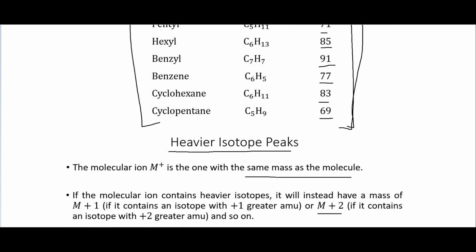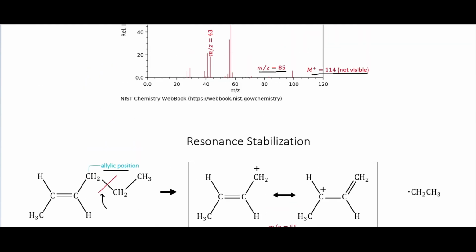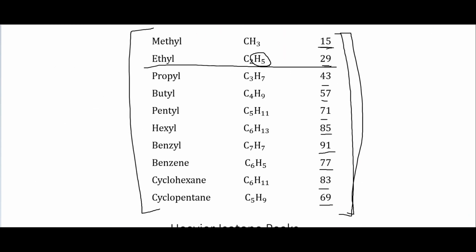But like I said, this can all start getting quite complex as you try to interpret it even more. But if you compare at least this basic level of being able to interpret these spectra with your IR and NMR data, then you can probably guess the molecule just from the data quite well.